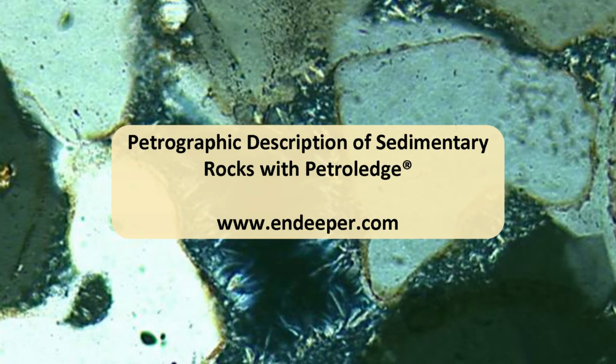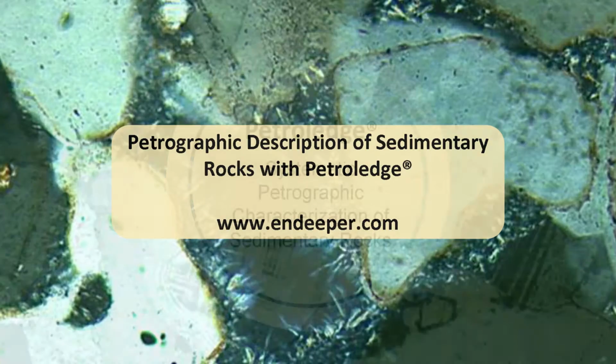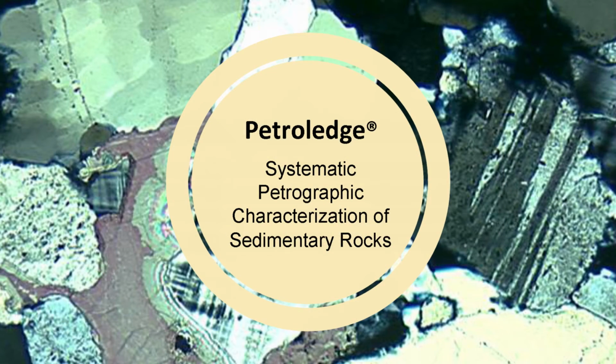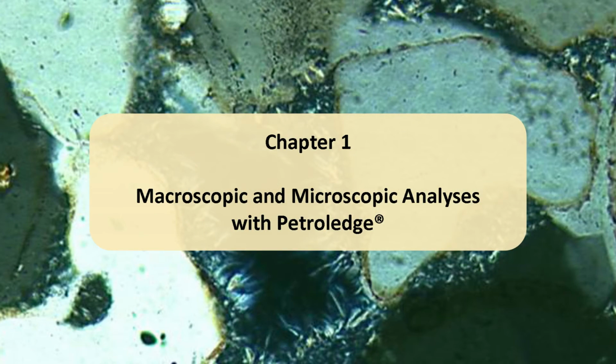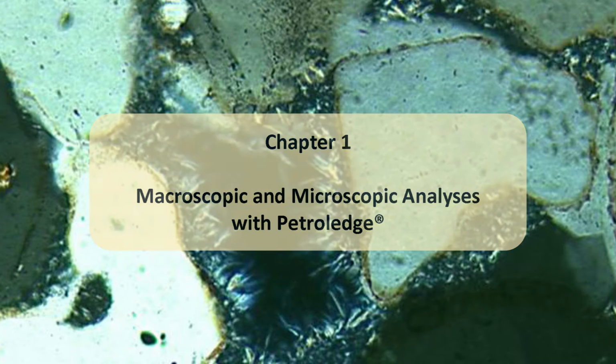Petrographic description of sedimentary rocks with Petroledge. Petroledge system optimizes the workflow for petrographic characterization of sedimentary rocks. In this chapter, you will learn to start a new description and to perform macroscopic and microscopic analysis with Petroledge.